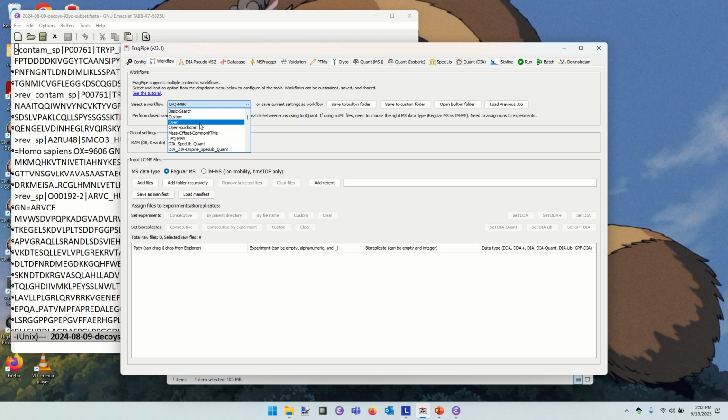So there are several options made available. In this case, we're going to use the wild and woolly option. We're going to use the blind modification search, which is what we would have called it in the sequence tagging days. We will say some mass that could range considerably in size is found at one location on a given peptide. So let's go ahead and set up for our open search.